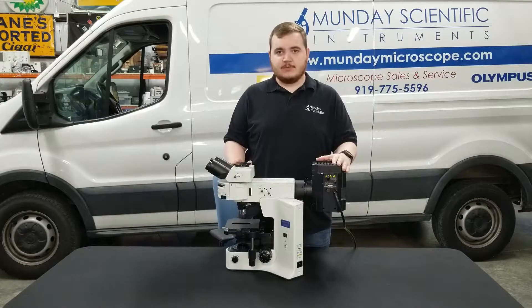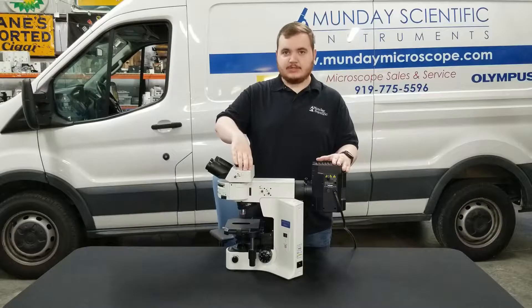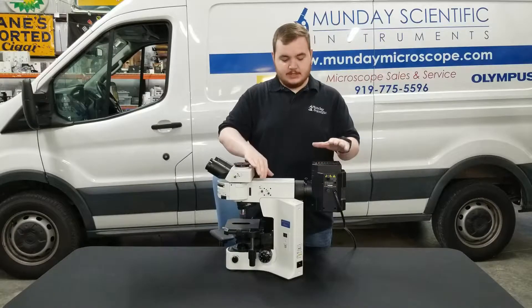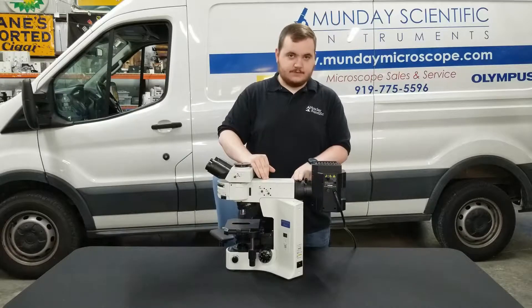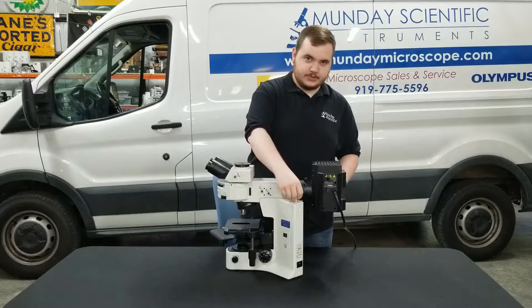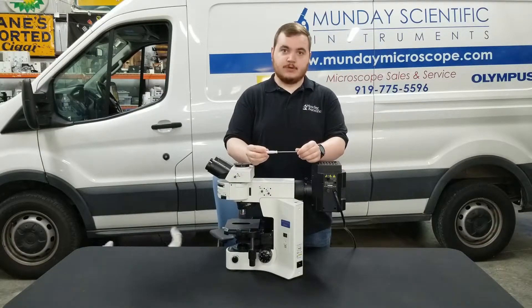To start off I'm going to point out some of the basic components you need to be able to recognize. This component on top is the head, then on the back we have the lamp house itself. Here is the flange that connects the lamp house with the fluorescent illuminator, and the most important piece is this little wrench right here — this is what we're going to be using to take the components off.